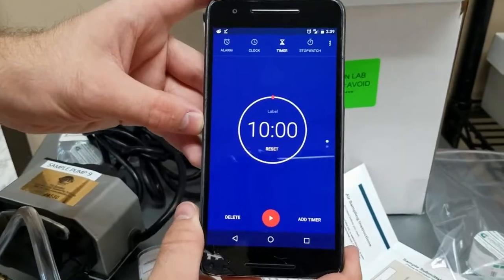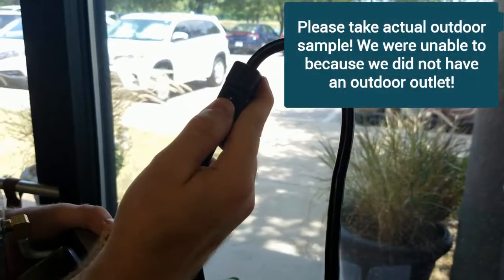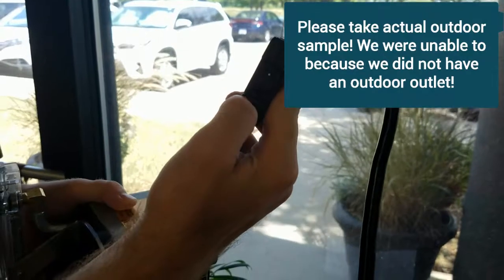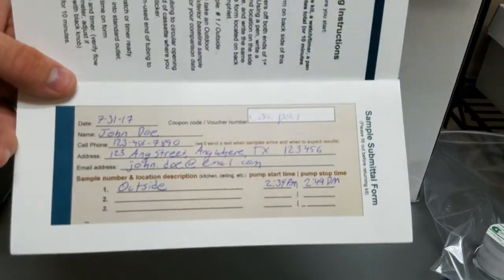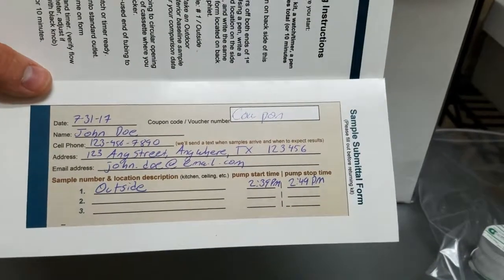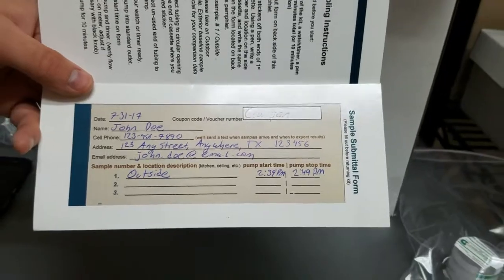Make sure to have the timer set to 10 minutes. Turn on the pump and start the timer. When your 10 minutes is up, stop the pump and make sure to record the start time and stop time on the pamphlet. This allows us to give you the most accurate mold concentration at a given location.